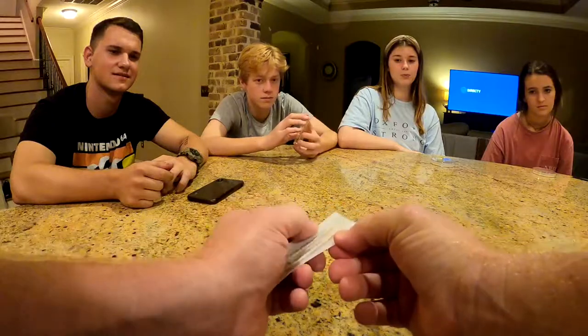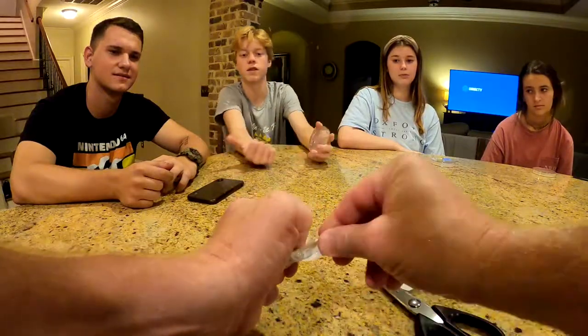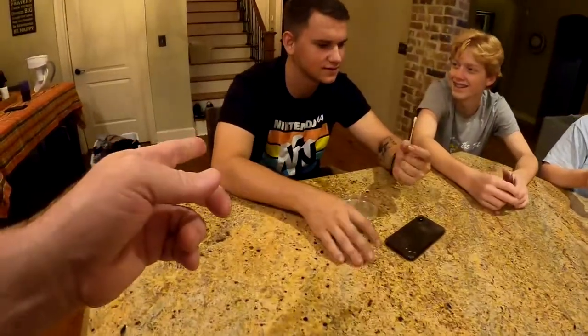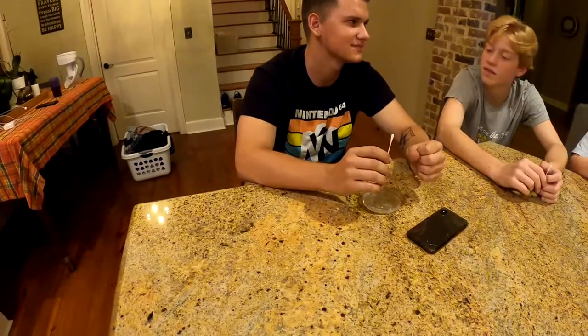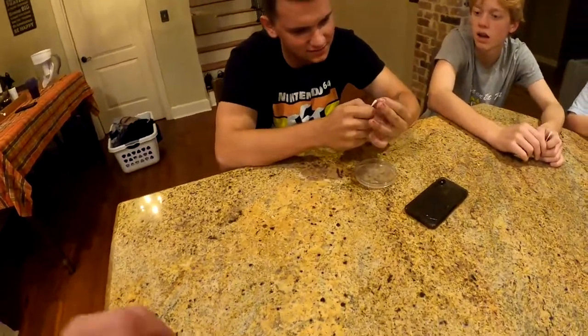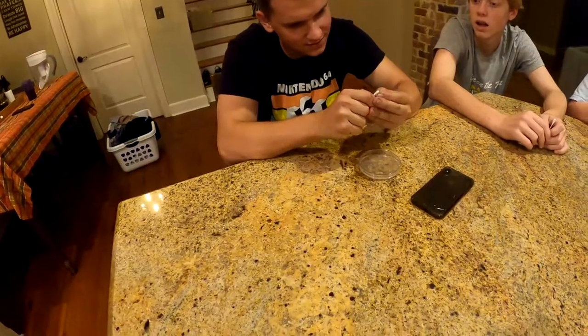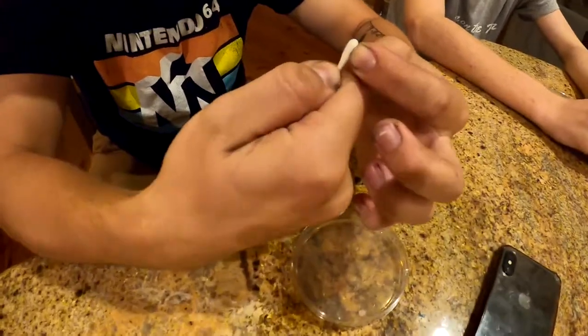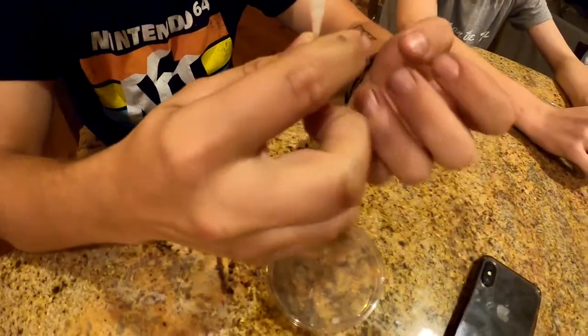We give everybody a cotton swab — you can swab whatever you want. David decides to swab under his fingernails. You've got to rub it under your fingernail; it doesn't have to have anything visible on it for there to be bacteria.